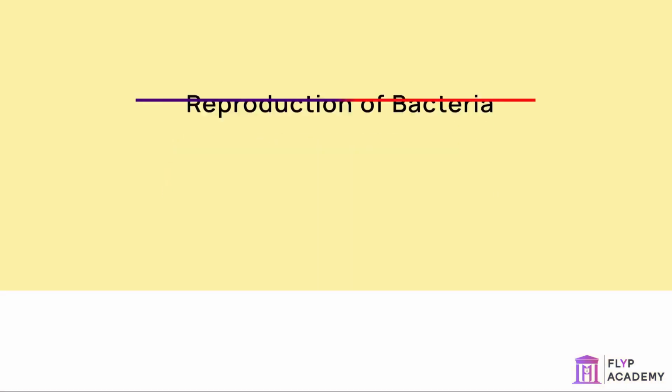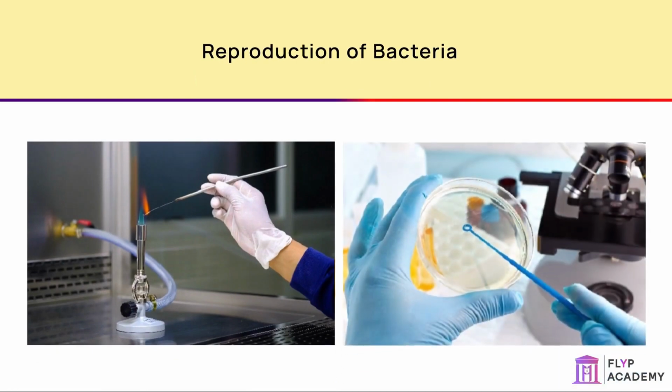The next step is to sterilize your inoculating loop, a small metal loop of wire used to transfer your bacteria onto the agar. You can do this by heating it in a blue Bunsen burner flame for a few seconds. You then need to dip your inoculation loop into the bacteria sample and streak it across your agar. Lift the lid on the Petri dish for the shortest time possible to prevent any microbes from the air entering.